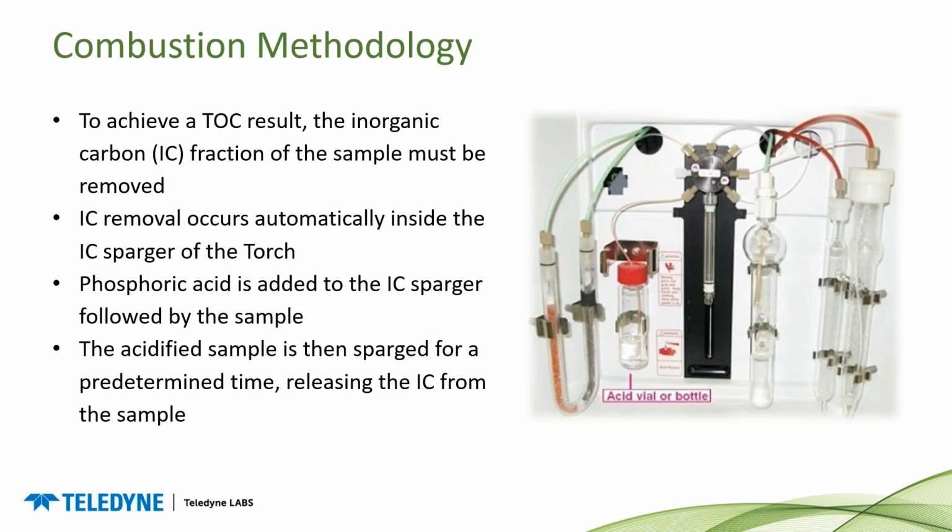So for the combustion methodology to achieve a TOC result, the inorganic carbon fraction of the sample must be removed. On the right here, we've got a picture of the front of the instrument inside the tinted shield once you open that door. On the right is the IC sparger. So IC removal occurs automatically inside the IC sparger.